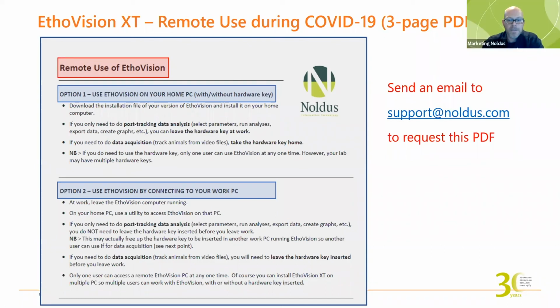Okay, we have two questions about updating. If we update the software, will we lose information analyzed with previous versions? Let's say we have version 12 to get to 15. Do we have to go through 13, 14, and 15, or can we go directly to 15? From 12, you can go to 15. If it goes to 7 or 8, then I would have my doubts. Then you would have to skip to an intermediate version first.